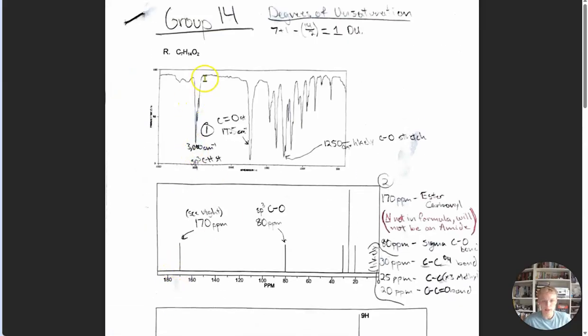If we had a carboxylic acid, we would expect a really broad peak, probably present somewhere in this range, and it would be a little broader maybe. But from the 2600 to the 3500 range, maybe that whole area. But it's clear we don't have a carboxylic acid.